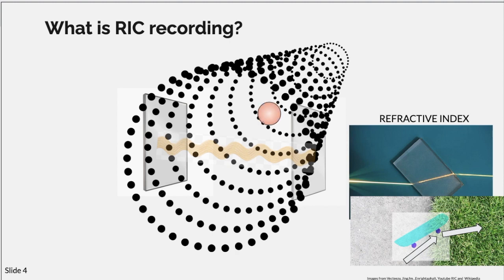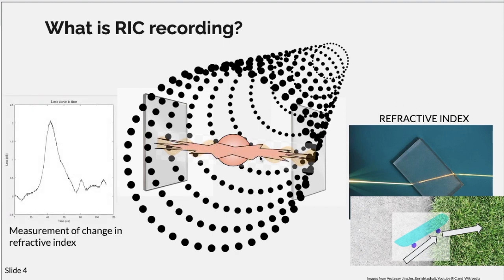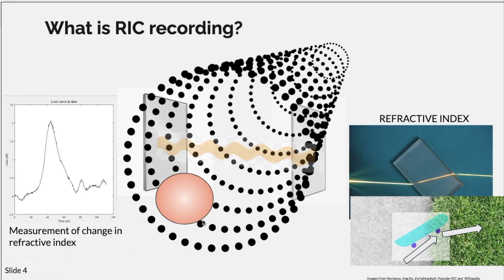And so the idea is when a fluid is pumped through the channel, individual cells pass through, and when an individual cell passes right here, it will change the refractive index because there's a change in material, and this change in refractive index affects resonance. When resonance is disturbed, the whole disturbance is recorded as a parabola, and it looks like this. Afterwards, when the cell passes through, it returns to normal.